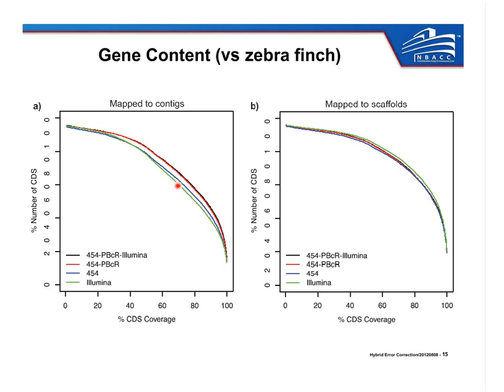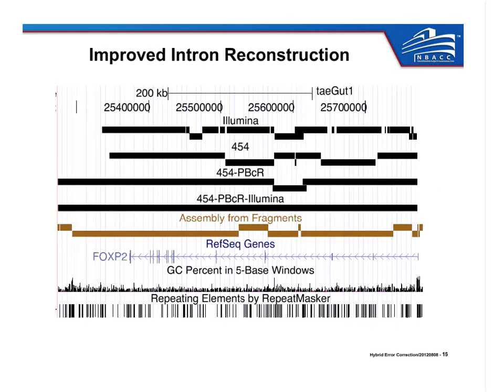And one great example of this is the FOXP2 gene. So this is an extreme example of a difficult-to-assemble gene. It's annotated along the bottom here. So these large vertical lines, these are the exons. The gene actually is about 400,000 bases in the genome with the expected short exons in the middle. So you can see that the vast, vast majority of this is intronic sequence between short islands of exonic sequence.